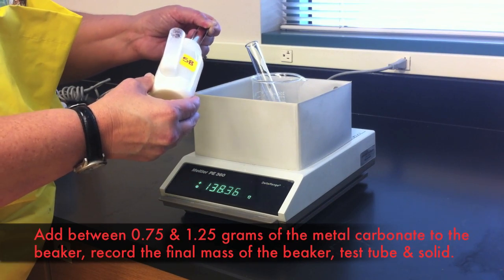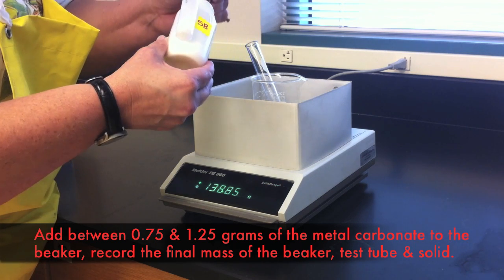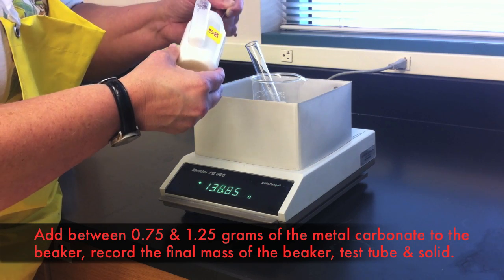You will then take your given carbonate metal and add it to the beaker. You'll want to add about 0.75 to 1.25 grams of the solid.